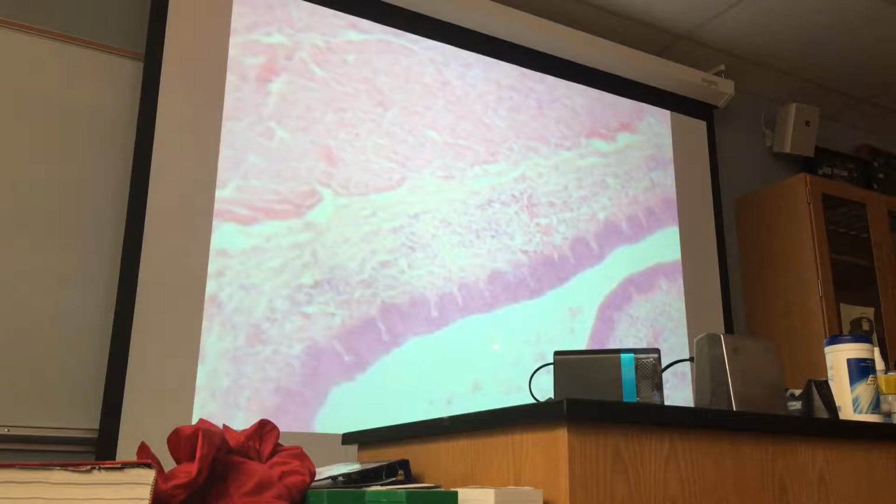Here we have a microscope with a pointer in the eyepiece lens, and that pointer can point to any structure, and I can ask you to identify it as indicated. If I put it on this, then you can say mucosal epithelium of esophagus. Here, lumen of esophagus. Do you get that?